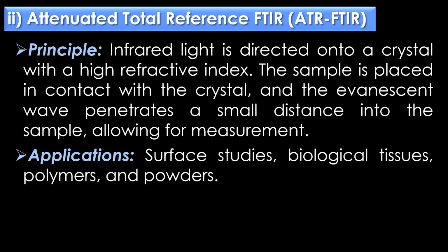allowing for measurement. This method is highly advantageous for solid and liquid samples as it requires little to no sample preparation. Applications: this ATR FTIR is used for the analysis of surface studies, biological tissues, polymers, and powders.